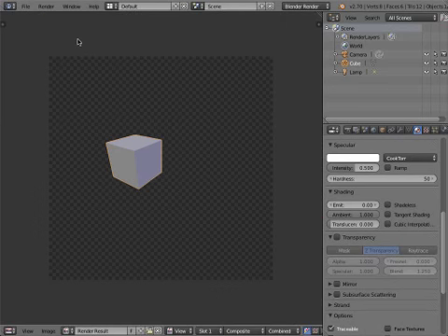So if you go OpenGL render image, it renders whatever is in your viewport exactly the way it is there, and very often that does the job very well. Better than you might be setting up your scene. So these days I even use it for production renders. That said, it will not have anti-aliasing, which means it's going to have those little jagged edges.